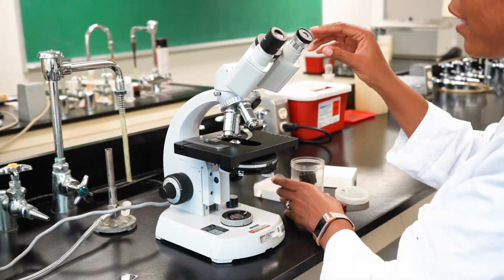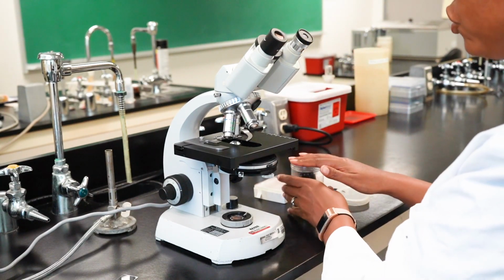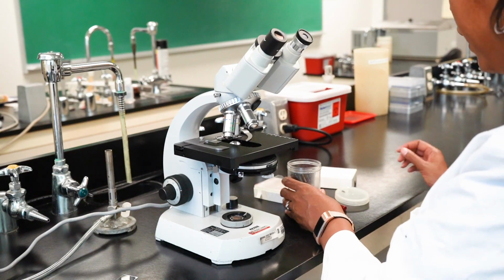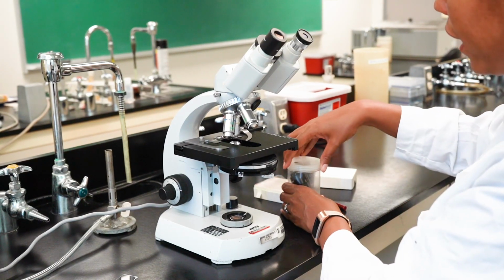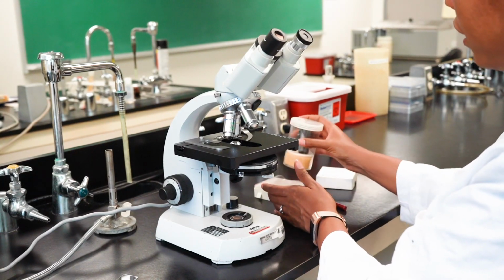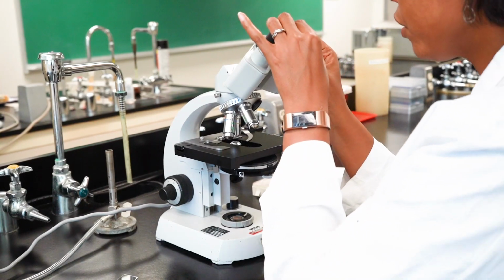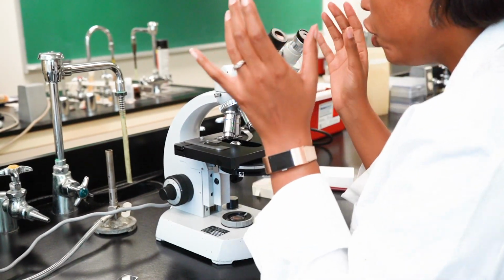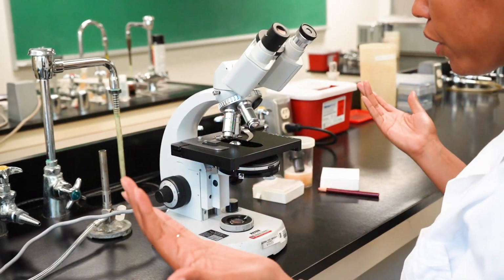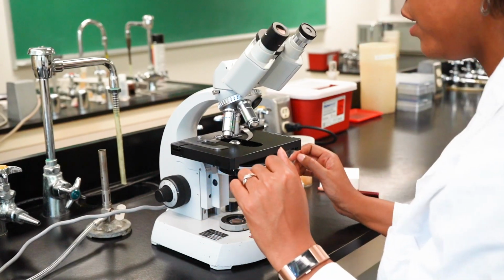When you take a lens out of a microscope, you should always have another lens to put in, and you should never rest the ocular lens on the bench, because when it's on the bench, it can end up on the floor. It should be placed back into the jar or canister or box that the telescope lens was kept in. Now, when you look through the telescope lens, you might see one of two things. You might see already a well-focused polygon, or you might see something that's blurry and hard to see.